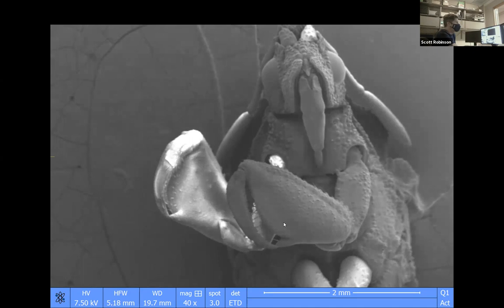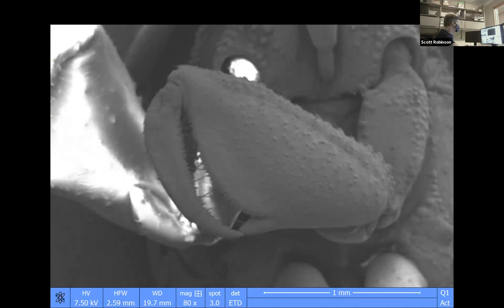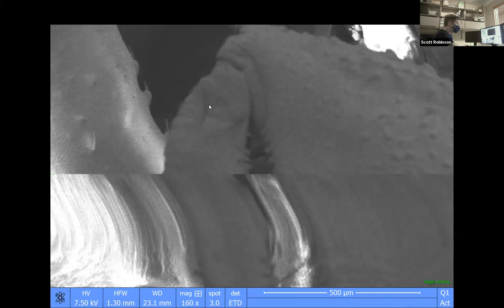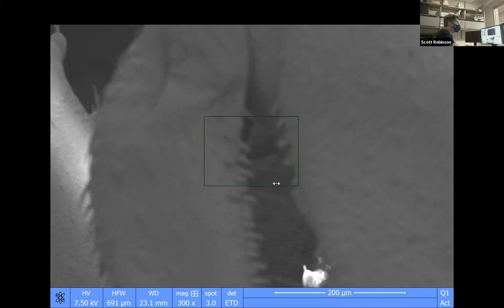Thankfully, the other arm, the left arm that's on the right, is much better grounded, and so we can see that arm. As Josh said, this is comparable to the arms on a praying mantis, where they can grab things and then hold them really tightly while they chew them, while they eat them. If we look at this, you can see that it's a really devastating looking arm. And if we look at it up close, we can see these little spines. And if we look at the spines up close, they're really cool looking.